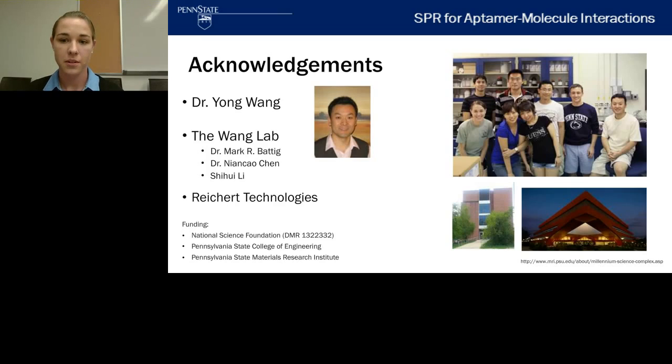So we often work with biotin-streptavidin interactions for SPR, and we find that usually we don't have a lot of non-specific binding in this instance. The biotin-streptavidin or neutravidin bond is very strong, so that's an advantage when we're immobilizing our ligands. And we don't find that we have a lot of extra binding to the surface in this instance.